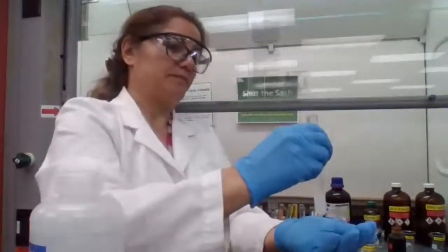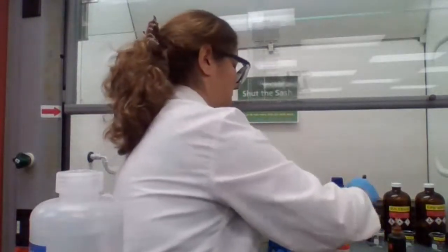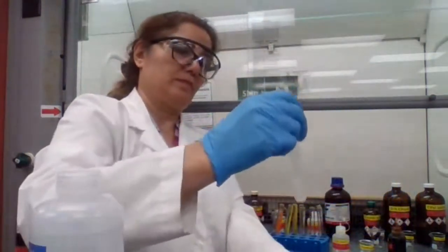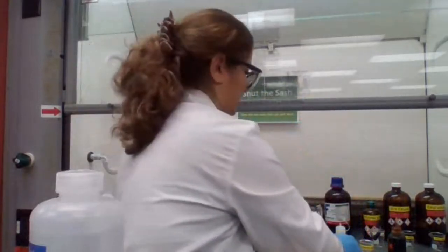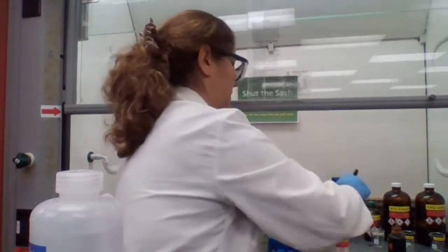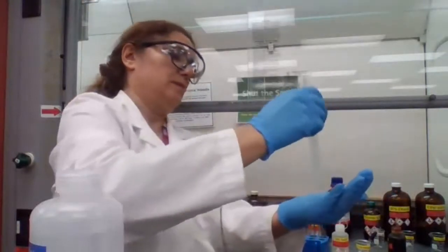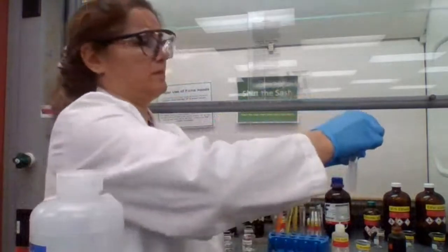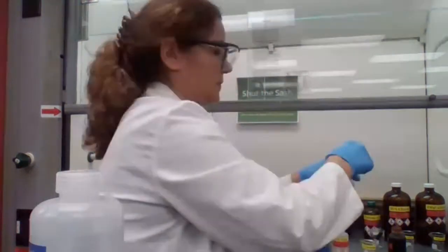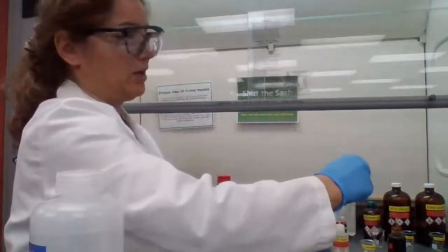Okay, it dissolved. I have a clear solution up here. Now I can add the iodine solution.